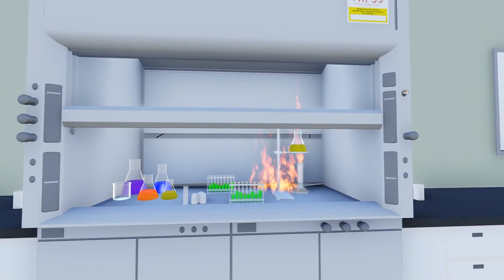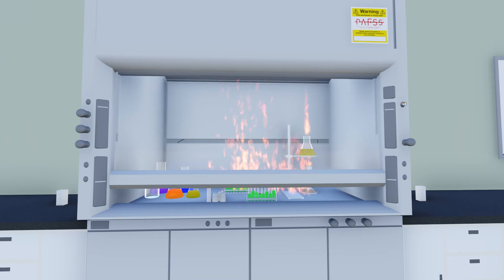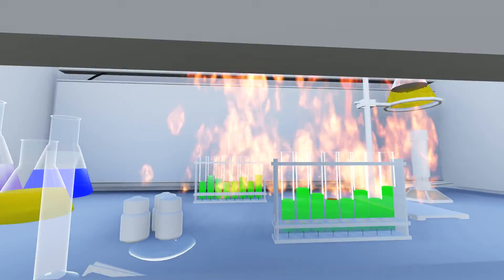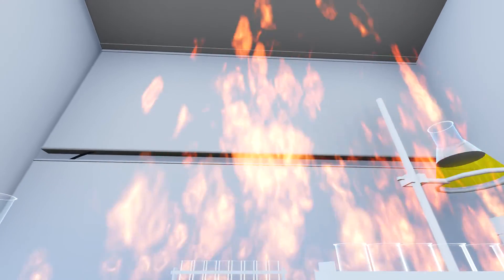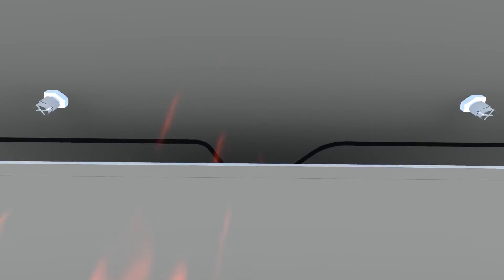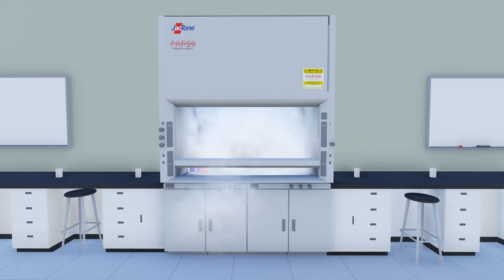In the event of a real fire, the sash should, where possible, be closed to its lowest level. The detection tubing will burst and lose pressure, opening the cylinder valve and releasing the extinguishing agent via the discharge nozzles into the workspace.